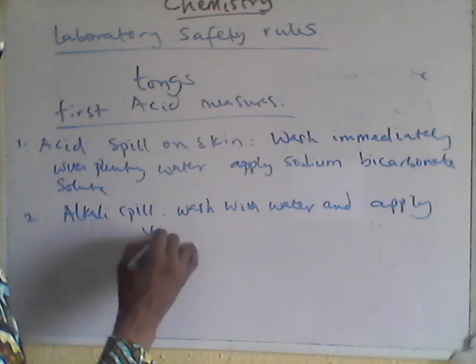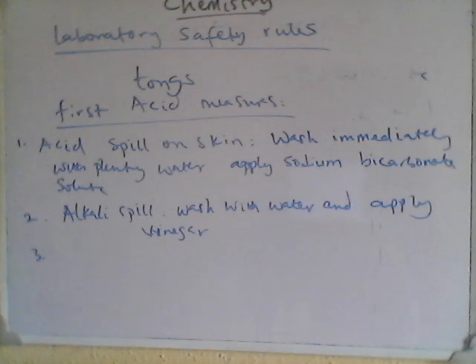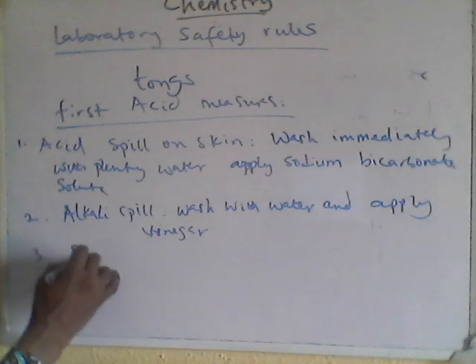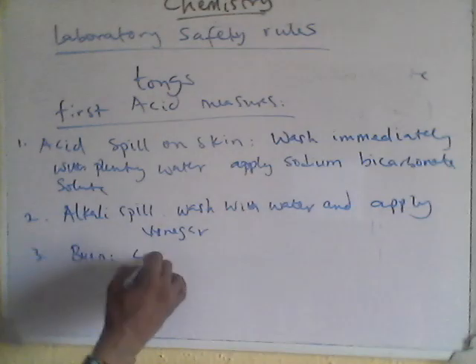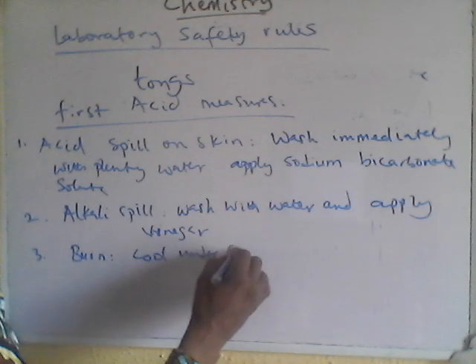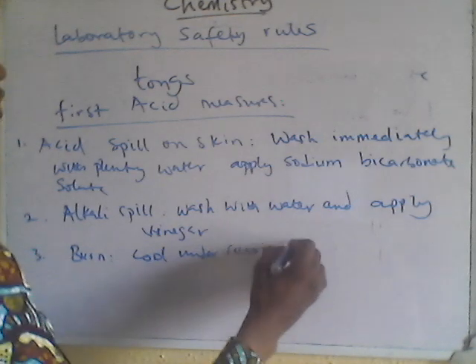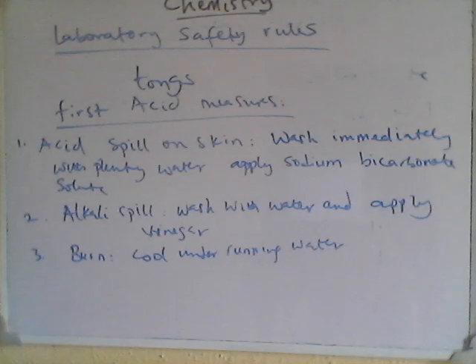Number 3, if you mistakenly burn yourself with fire, you cool that part of the body under running water, and seek medical help if it is very severe.